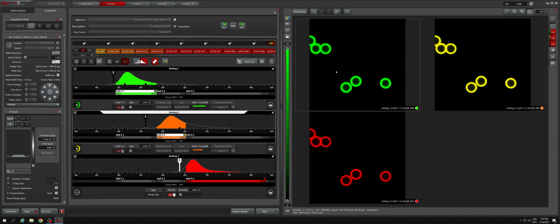So what you need to do is go over to the panel you want to adjust and then click on it, and then you can go back to that panel control box and start using the smart intensity and the smart gain. And you can see I'm turning it down because it looked just a bit too bright. There you go. So now it's a little bit sharper and more defined. Now I go over to the second panel, click on that, and I'm going to start adjusting it and turn down the intensity and brightness a little bit.